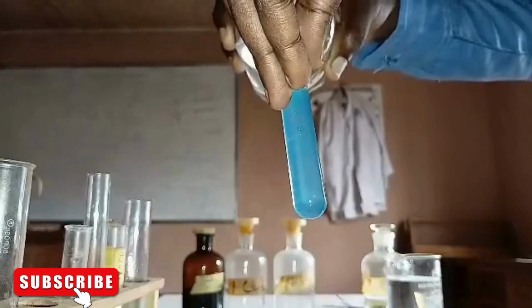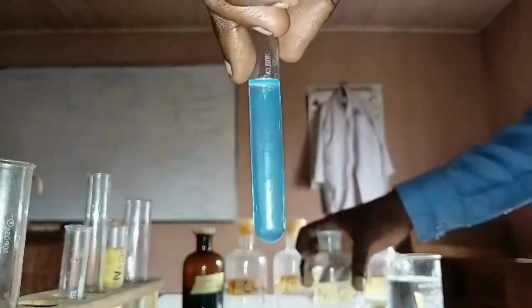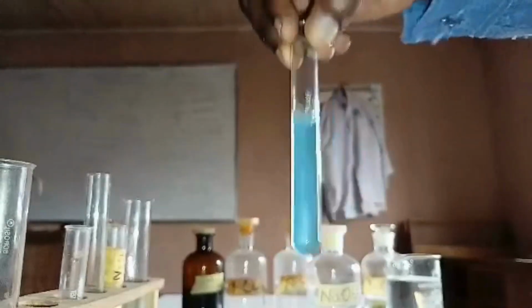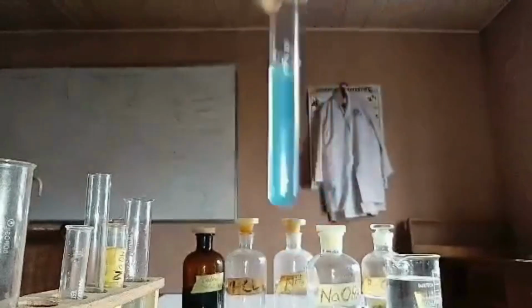That is, the precipitate did not dissolve in excess of sodium hydroxide. So you're shaking to ensure that the precipitate did not dissolve, just for confirmation. And as you can see, the gel is strongly present, failing to dissolve.